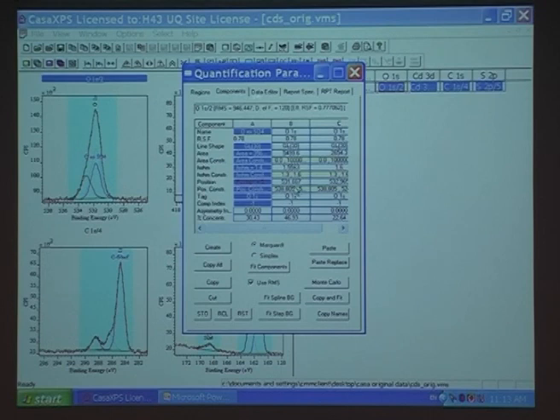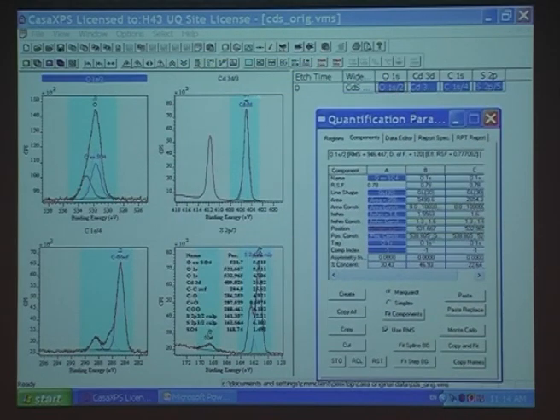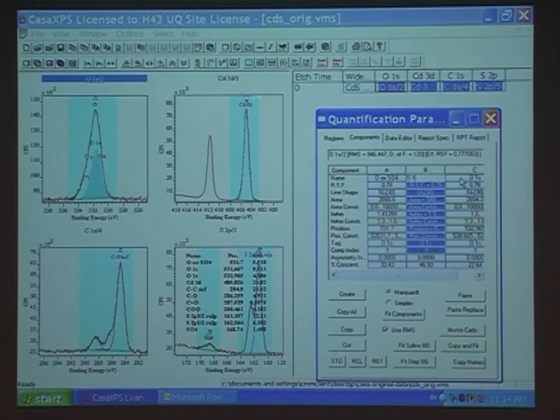Now we've got another oxygen here. This is the one at oxygen 531.7, isn't it? I've got them just wrong there. Yeah, this is the one, XSO4. This one's very close too. So two of them are very close together.